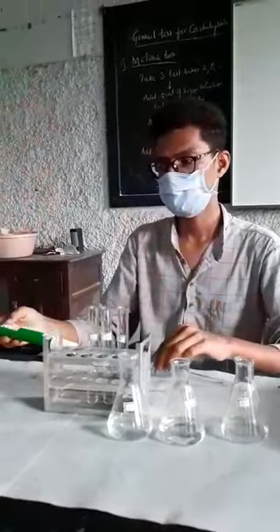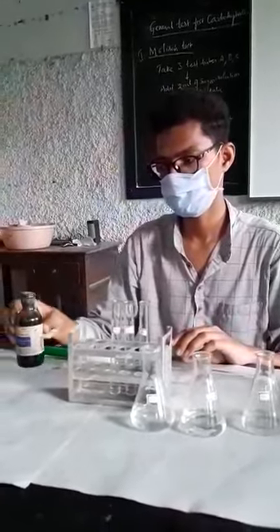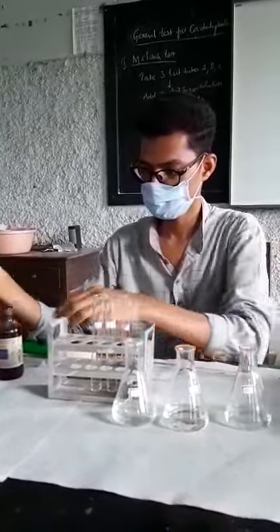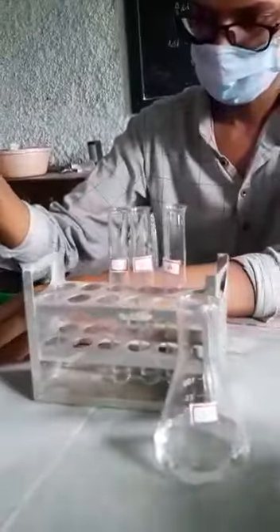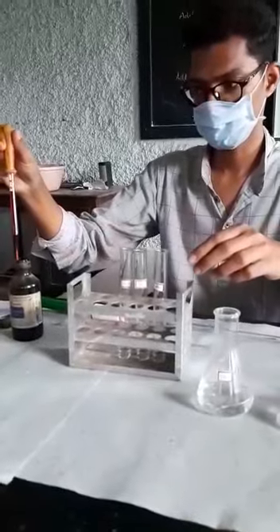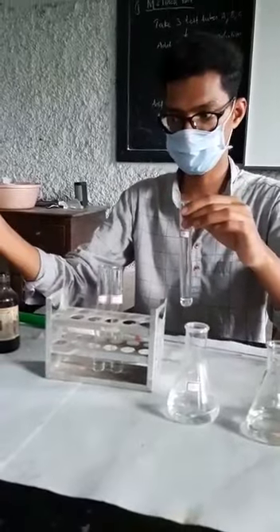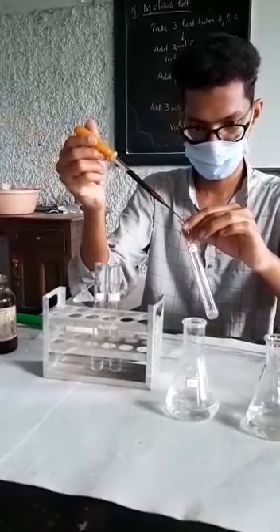Okay, now he will take out the Molisch reagent. Molisch reagent is a commercially available reagent. You can use it directly, and he will take a few drops of this Molisch reagent and add it to the different test tubes. And let us see in which test tube we will find the change in color after adding the sulfuric acid. Okay, you first add Molisch reagent, a few drops in each. 2-3 drops is enough. Okay.